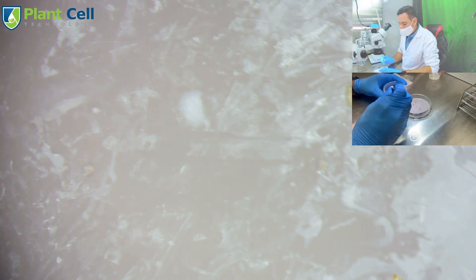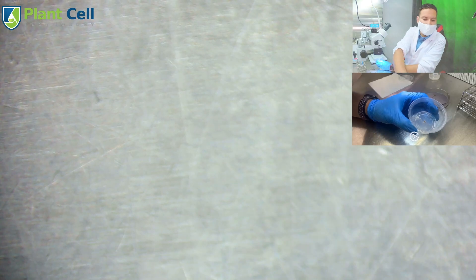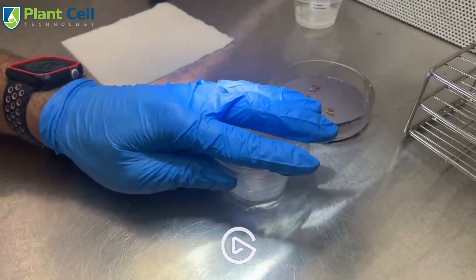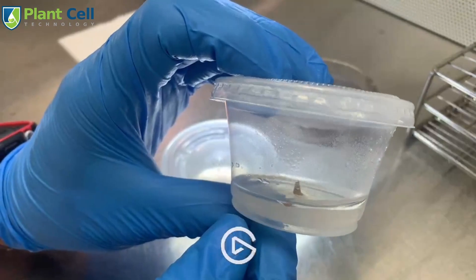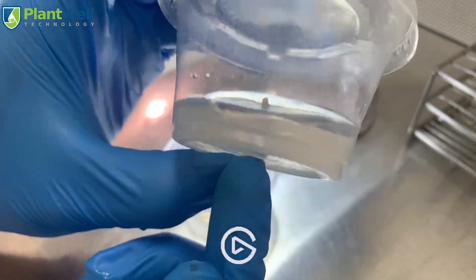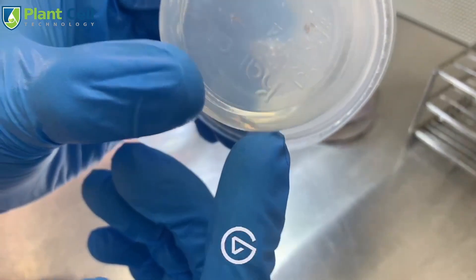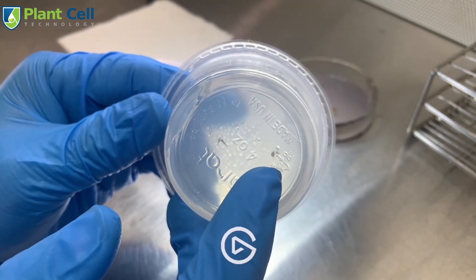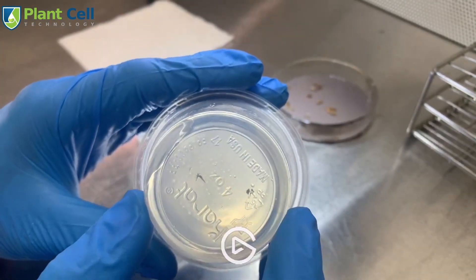I want to place it into new culture media. There we go — you can see it a little bit better now. I have two pieces. This one has an apical meristem right here at the very bottom of the node. This piece has two apical meristems — one came up very clean, the one on this side also came up very clean though it's hard to see. The other one didn't come up very clean and I'm not sure if I even have the meristem there, but I'm going to place it in the media anyway.